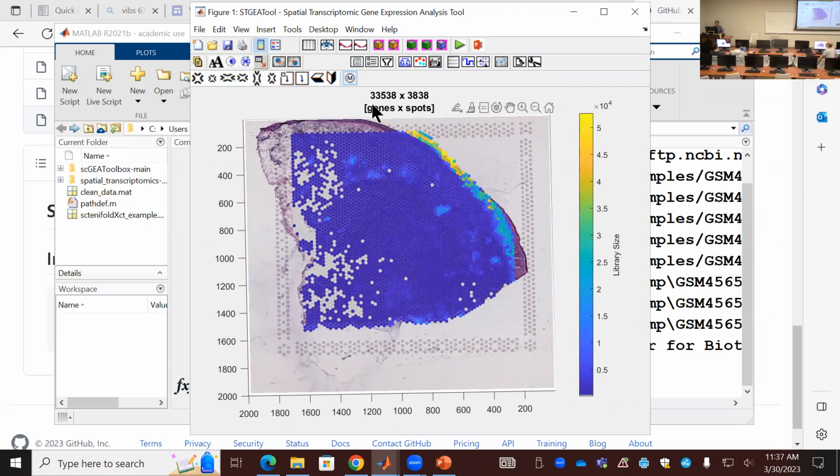So it doesn't matter actually. Yeah, they do have a special barcode. I don't know how to use that information, so I just manually align them.